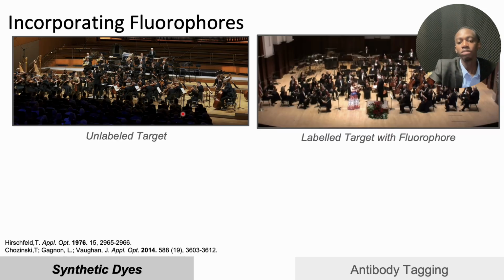And a very good example right here. Assume this is the inner cell we are looking at, and we are trying to look at the mitochondria in this case. Well, you can't really tell which is the mitochondria because it's not tagged. But in this image, you can easily tell this is the mitochondria because it's clearly tagged, and you can see, okay, this is what I'm looking at. And so that's how tagging comes into play.